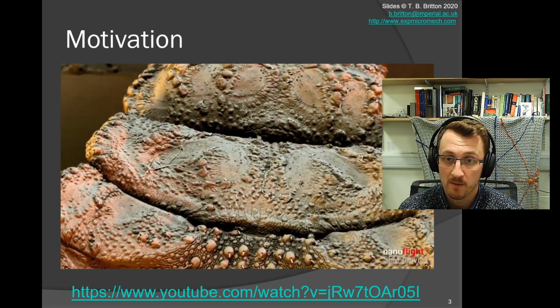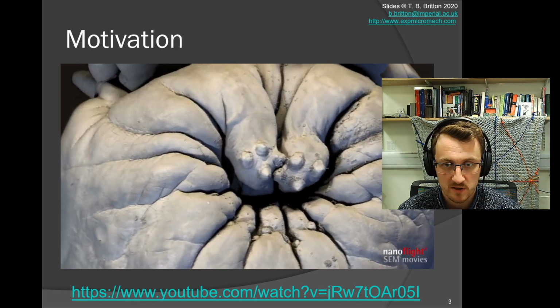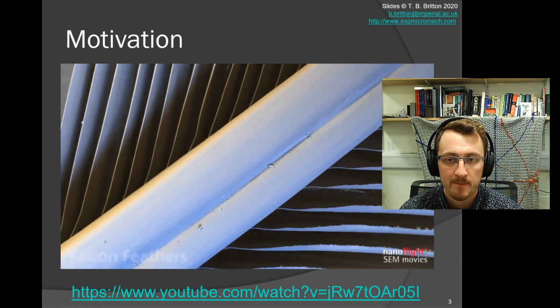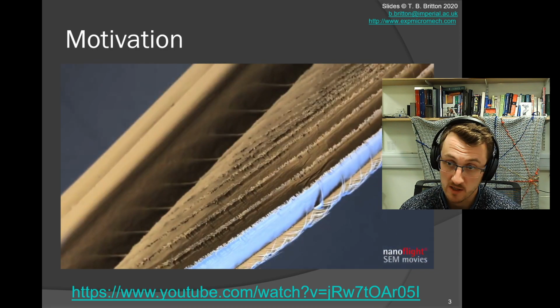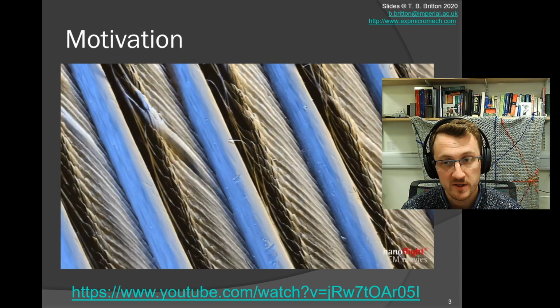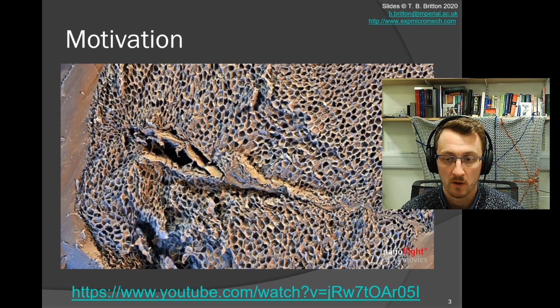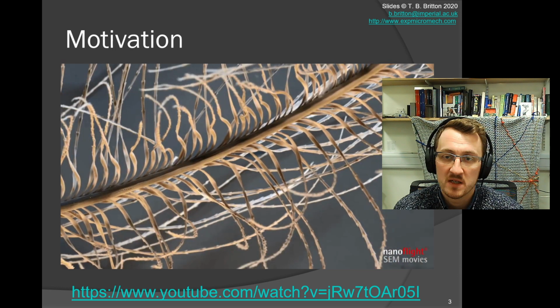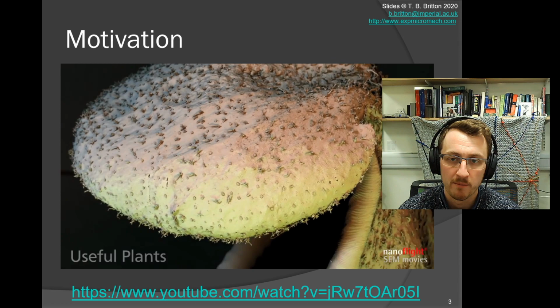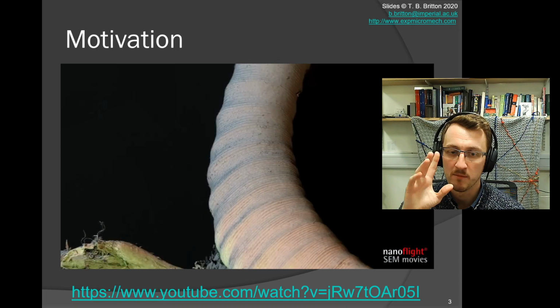This is well set up to take a series of images and create these videos by changing magnification and the object with respect to the microscope. Many of you may do this, for instance, as you look at biological systems, as presented here, but also perhaps as you look at things like fracture surfaces or other larger objects. Some of you may be looking at fine features, but use this opportunity to pan in view to find and locate the interesting objects within your electron microscope. In certain cases, we may do in situ measurements. Here we can see the electron beam is dehydrating and burning samples, and so those fibrils are actually moving as we look under the electron beam.